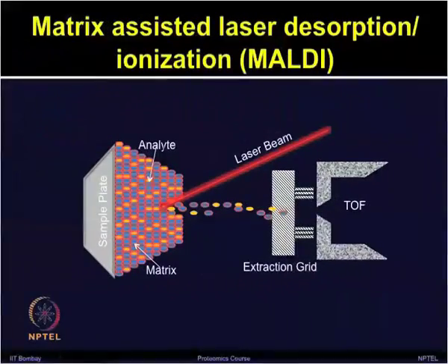The ionization source is responsible for converting analyte molecules into gas phase ions in vacuum. This has been made possible by the development of soft ionization techniques, which ensures that the non-volatile protein sample is ionized without completely fragmenting it. Most commonly used ionization sources are MALDI and ESI.